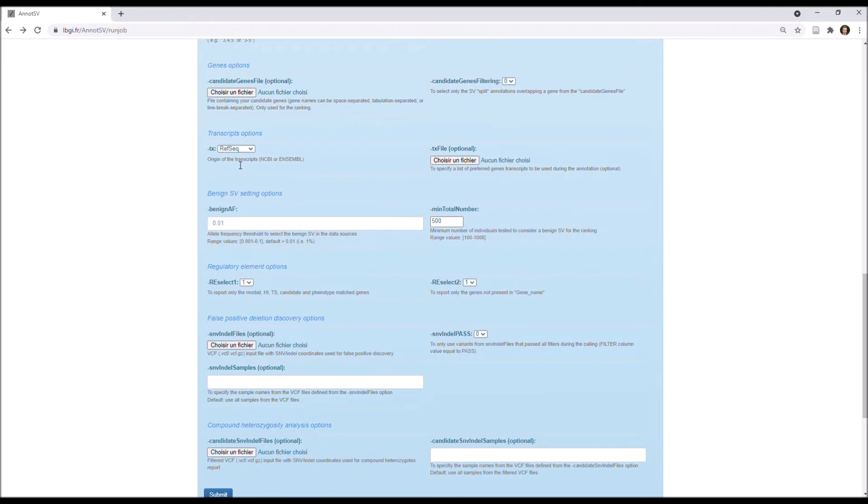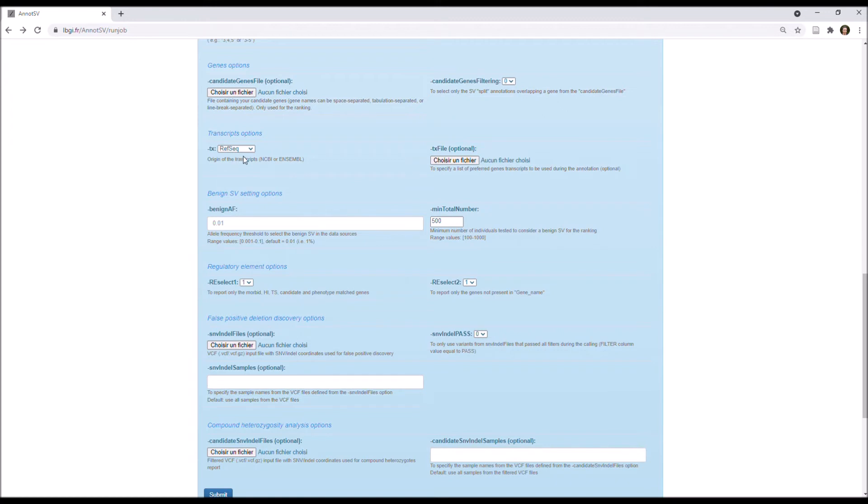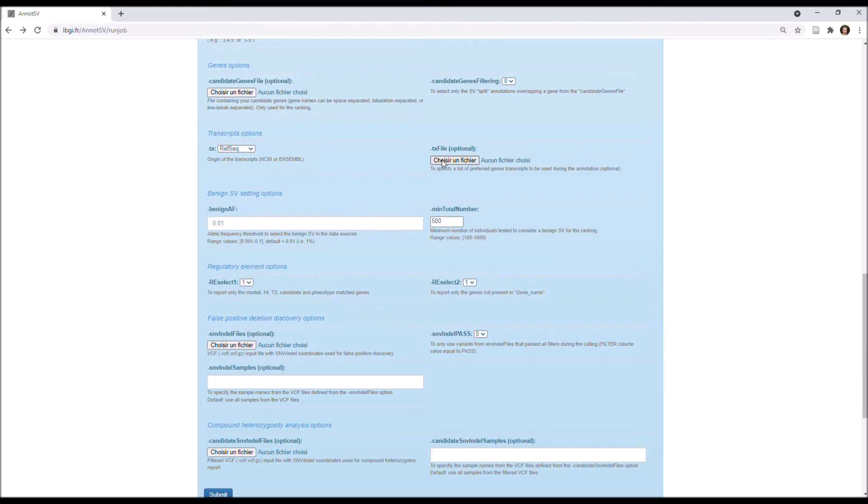Then you have options specific to the transcript. There you can choose to use transcripts from RefSeq or from Ensembl, and it's good to know that for each gene, only a single transcript from all transcripts available for this gene is reported. So, first, AnnotSV reports the transcript selected by the user with this option, and so you can upload a file with your preferred gene transcript. Else, the longest overlapped CDS is reported, or if there is no difference in CDS length, the longest overlapped transcript is reported.